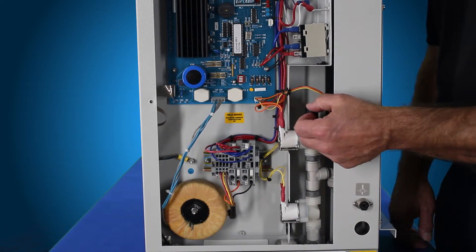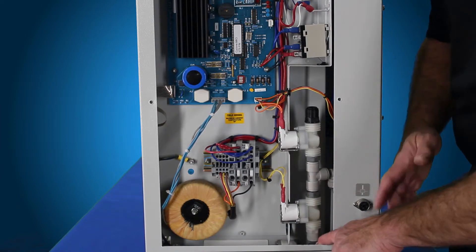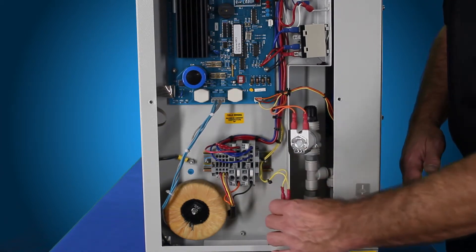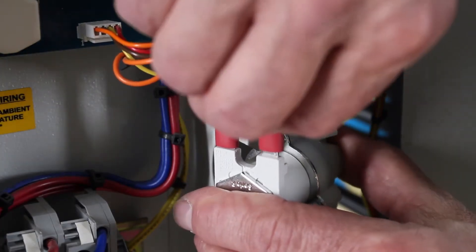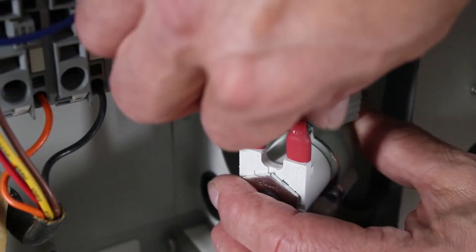Just press down on this ring and pull out on the fitting — that's what we're going to do down here. Press down on the gray ring and pull out on the piece of tubing. First we're going to rotate these solenoids out of position so we can remove the wires. Simply pull up on the two wires and set those aside.